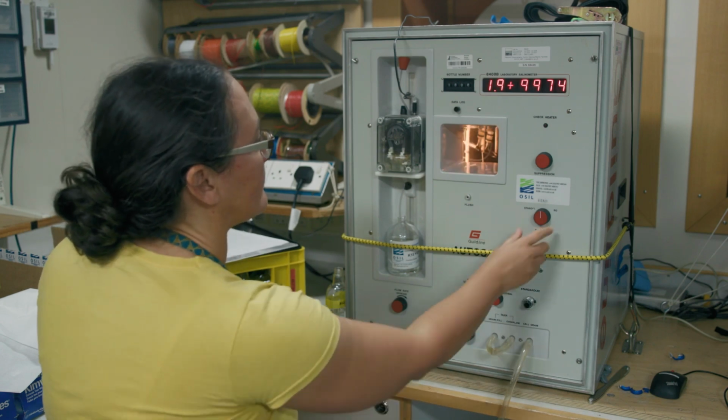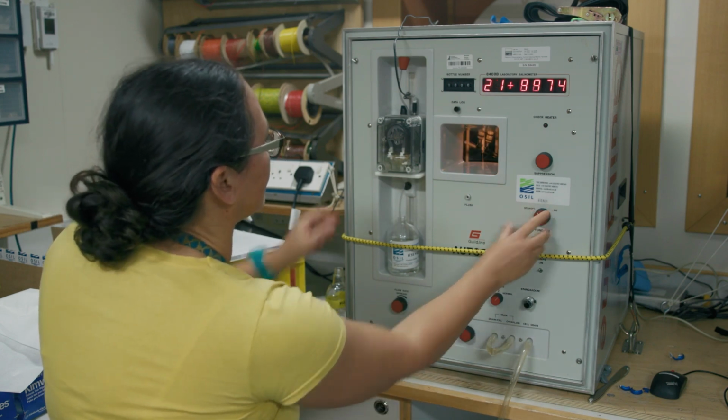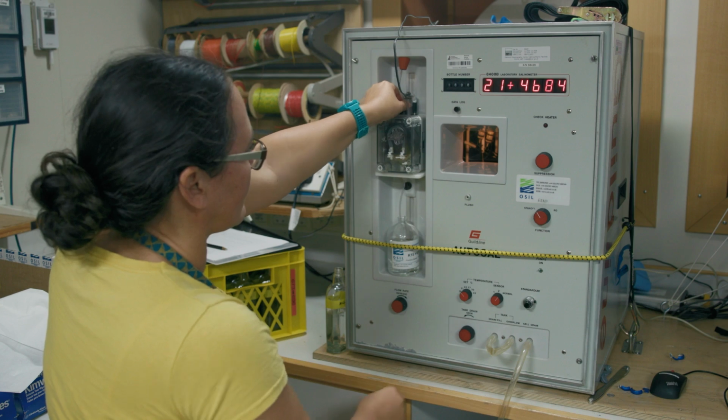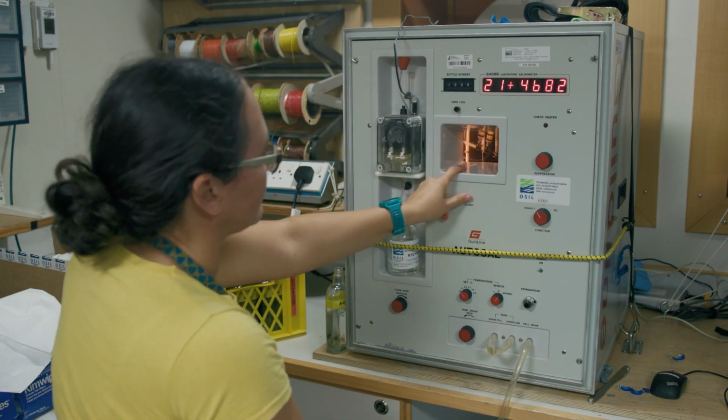We can switch back to standby, and again, this is important to do here to avoid electronics overloads, which introduce error to the reading, and then draw another sample from the same bottle by flushing and filling once.